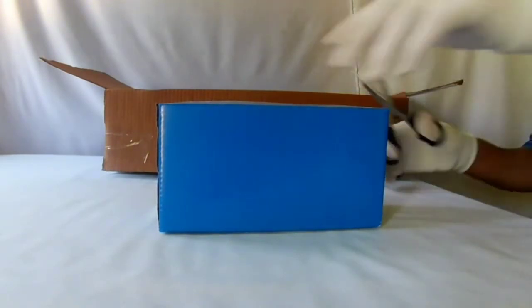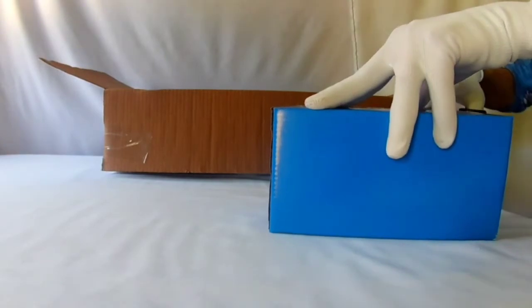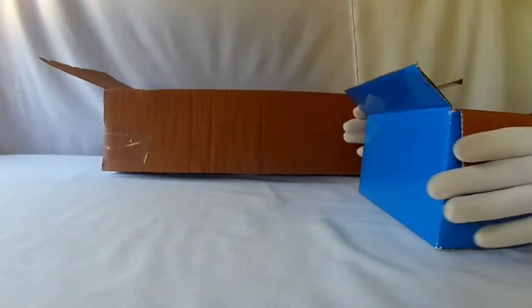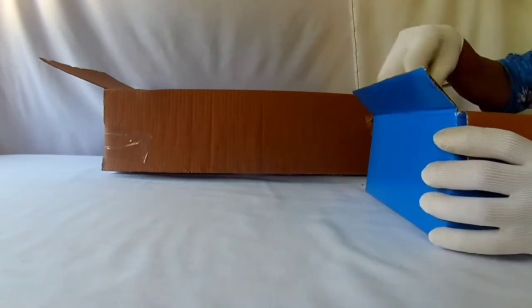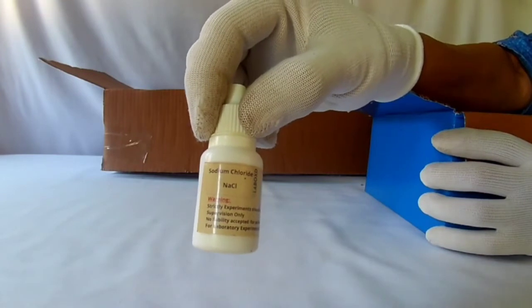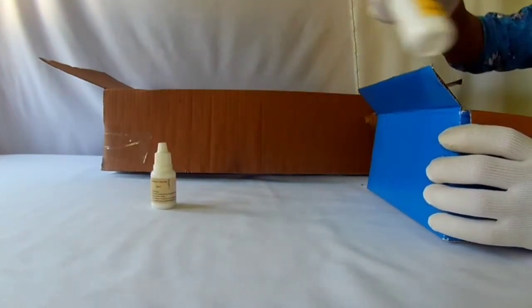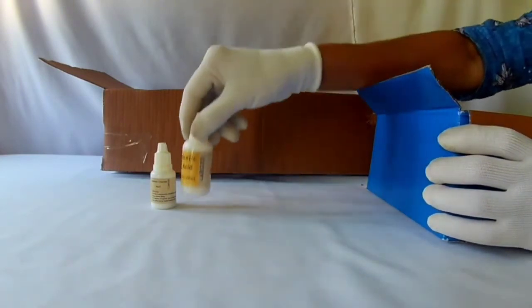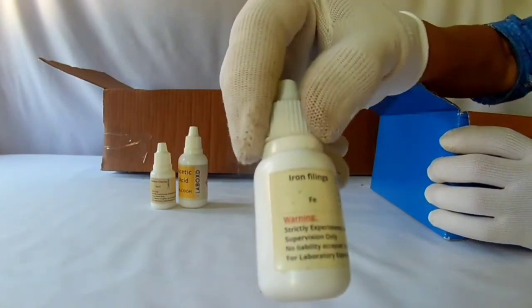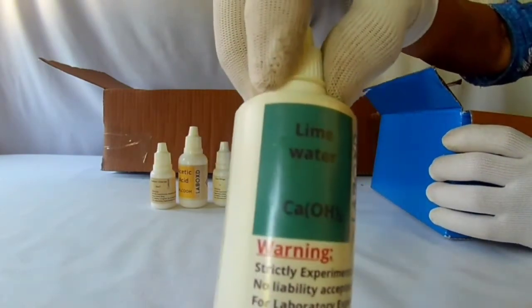Another small box has some items. Let us open it. These are some chemicals. Sodium chloride. Acetic acid. Iron filings. Lime water.